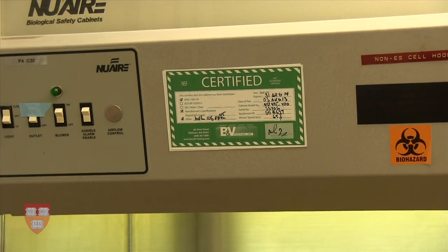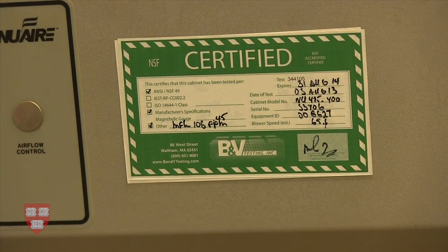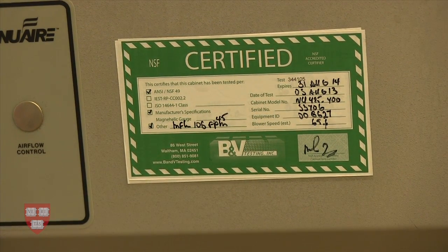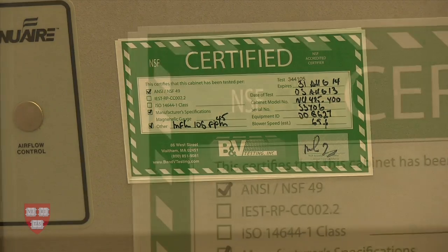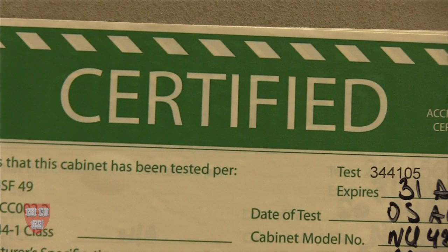Any installed BSC must be certified annually. Check the certification label on your unit to verify that it has been certified within the last year. Certification is always required if the cabinet is a new installation, has been moved, or undergone a major repair.